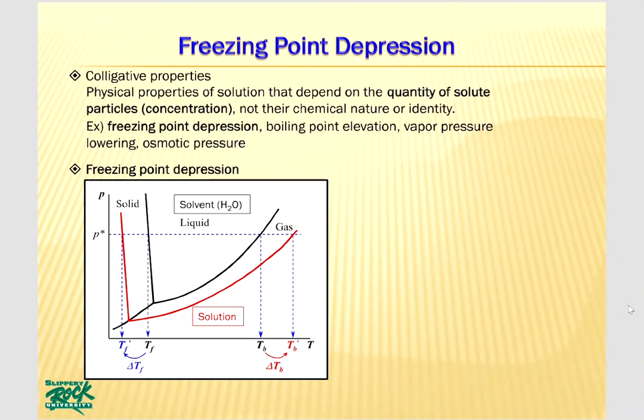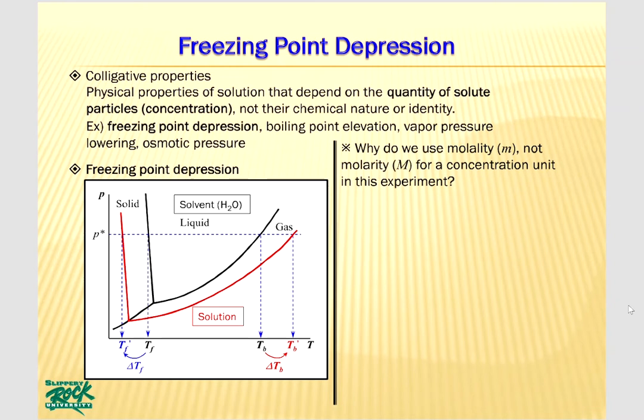experiment. Please be aware that you will use molality for concentration, not molarity. The reason behind is that molality is temperature independent, while molarity is temperature dependent. Molality is the moles of solute over the kilograms of solvent.